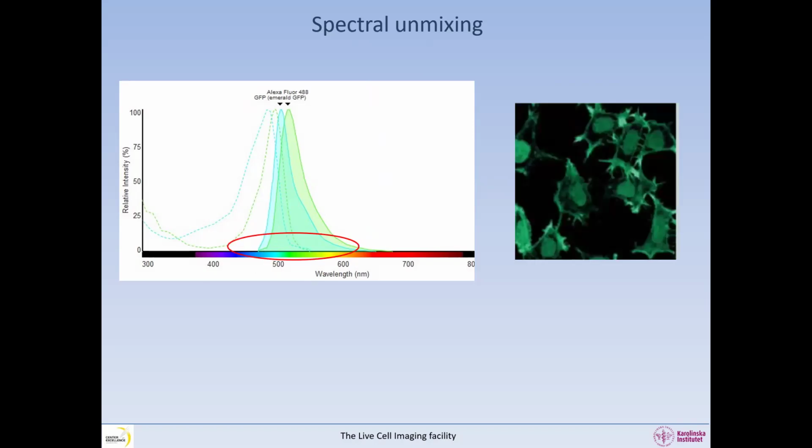Even if you know the biology behind it, where the proteins labeled with GFP or Alexa 488 are localized, it will still be very hard to prove or show what they really are. So this is when we can perform linear unmixing, as Nikon calls it, or online fingerprinting, as it is depicted in the Zeiss software.